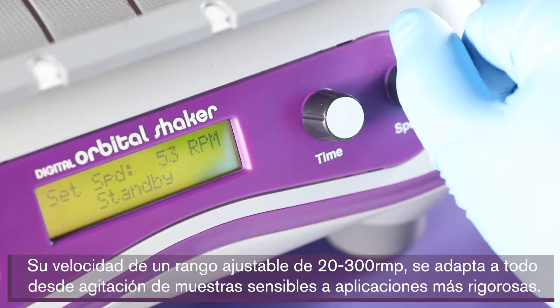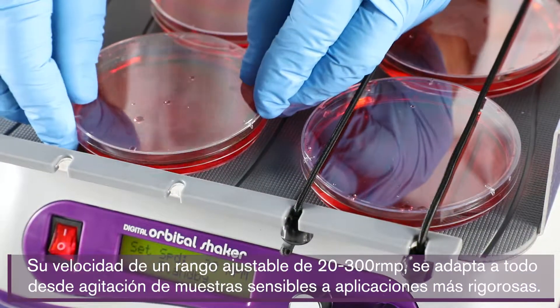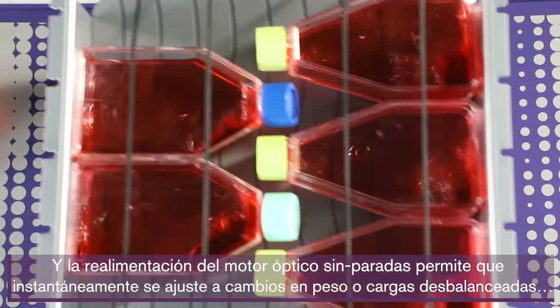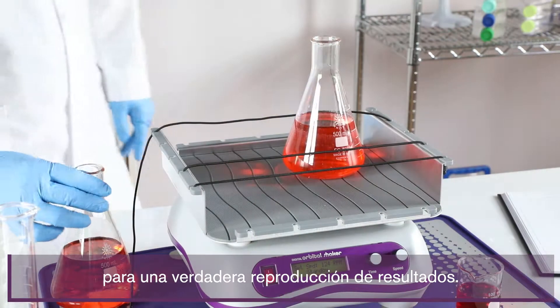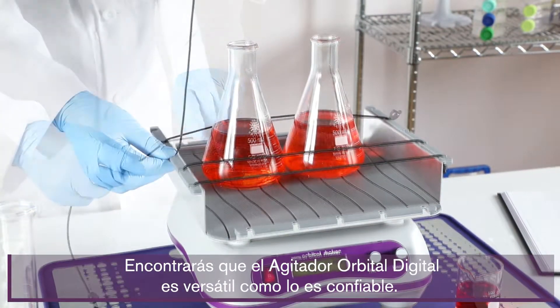Its adjustable speed range, 20 to 300 rpm, accommodates everything from sensitive sample agitation to more vigorous applications, and a no-stop optical motor feedback allows it to instantly adjust to weight changes or unbalanced loads for truly reproducible results. You'll find the Digital Orbital Shaker is as versatile as it is dependable.